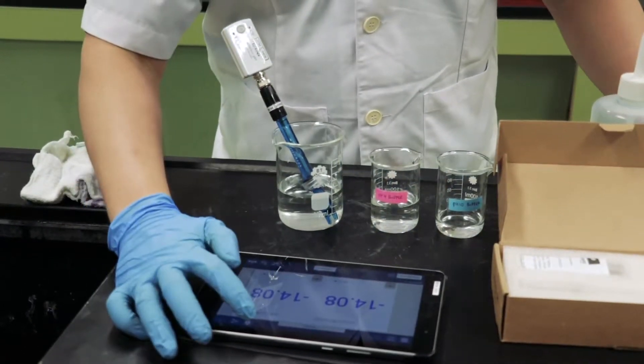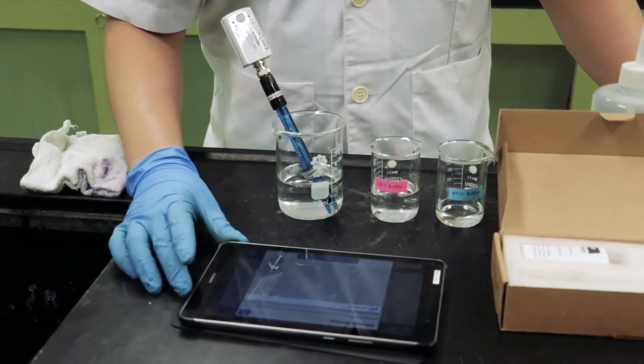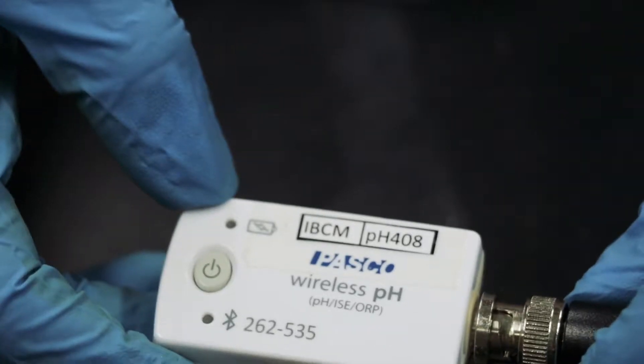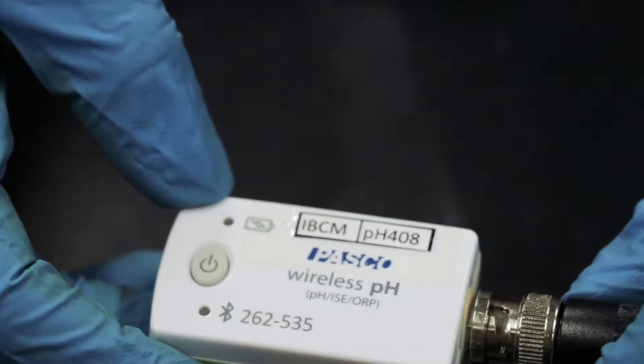Press the power button and connect your phone to the PH Probe via Bluetooth. The LED should display a single red flash to signal that the PH Probe is turned on.